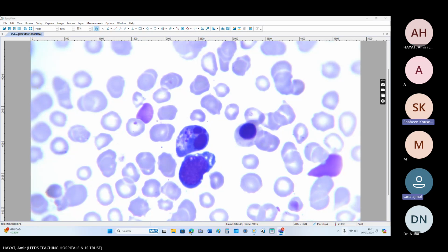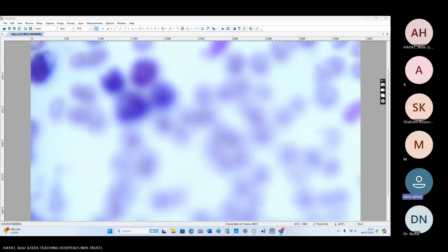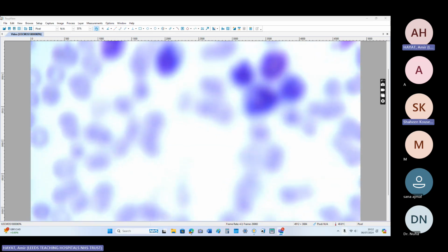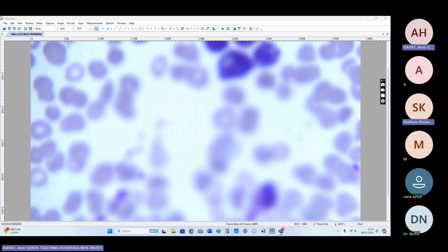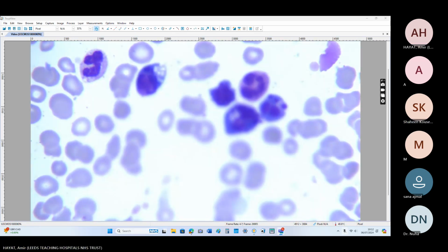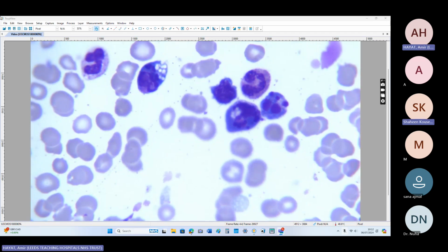CD19, yeah. CD43 is also, I remember always, CD43 is positive in Burkitt. CD81 is usually positive in Burkitt. I think it is a marker of proliferation. And CD38 as well is a marker of proliferation, along with plasma cell leukemia. Ki-67 is positive, but this is on immunohistochemistry, and it's very high, more than 99 percent.